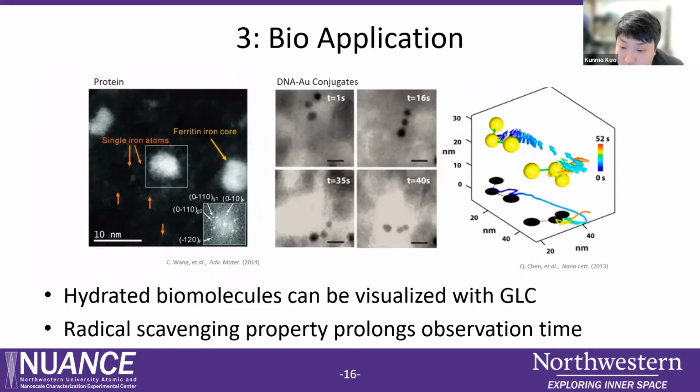For example, the figure on the left side is an image of ferritin, which is an iron-bearing protein. Also, since it is not frozen, a molecule inside the GLC pocket can move freely. Therefore, we can also observe the movement and live reaction of the biomolecule.